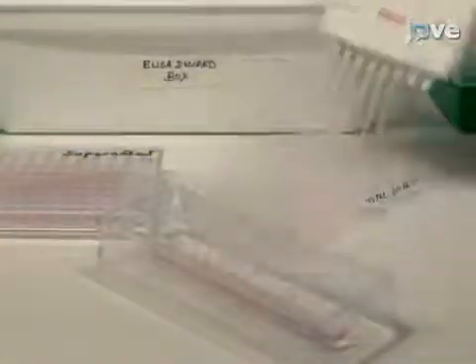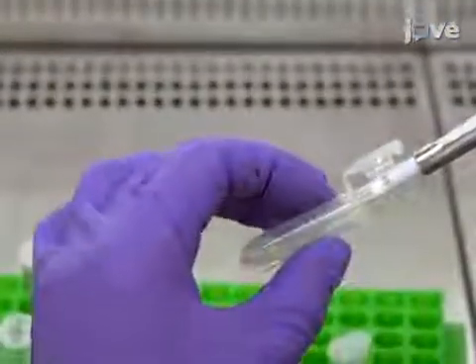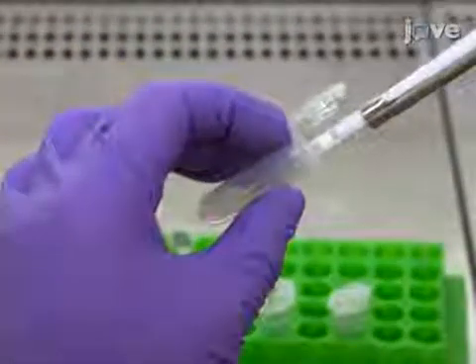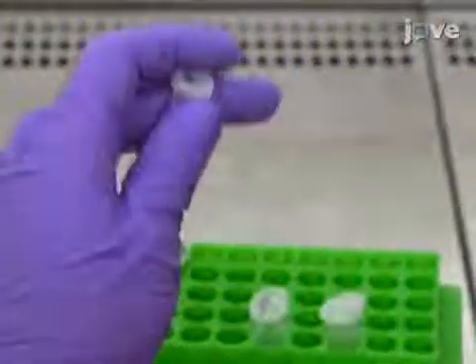With the plate prepared, dilute the supernatants with 4 volumes of RPMI. Then, for standard controls, make a serial dilution of human IgG solution in RPMI from 1,000 nanograms per milliliter to 15.6 nanograms per milliliter. Also include a blank.